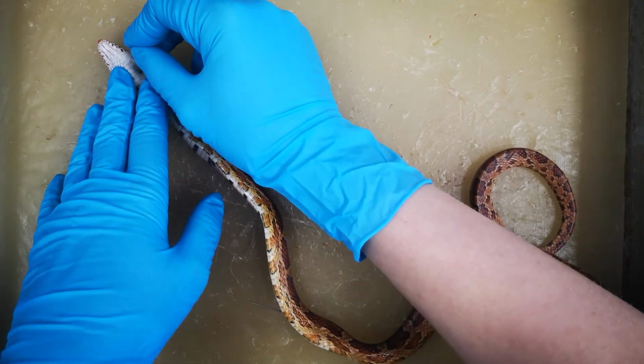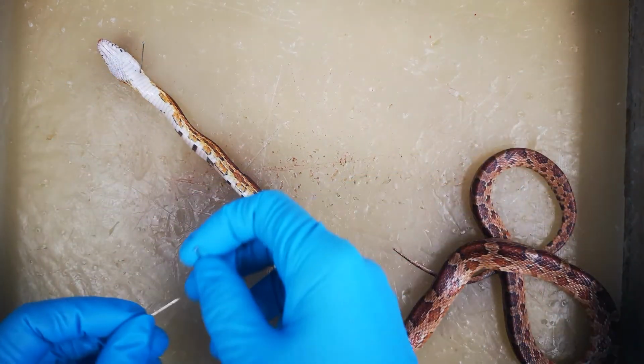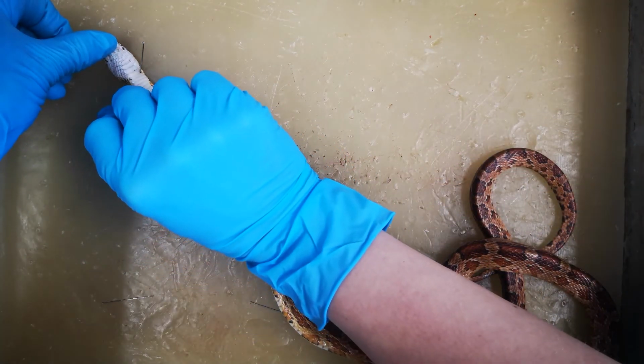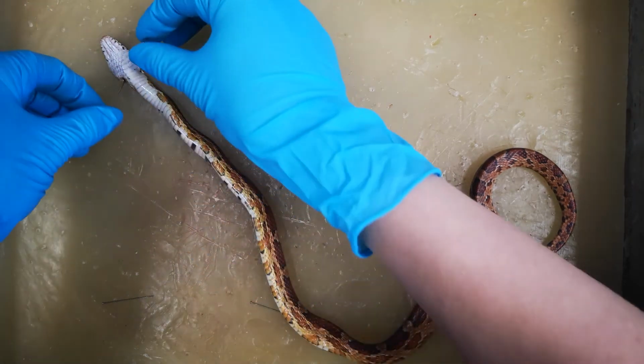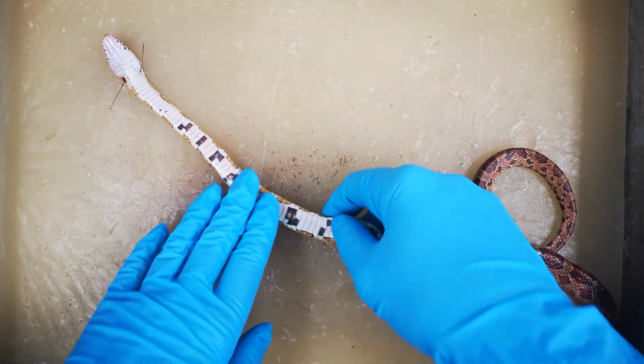To prepare the snake, we pin it in place. As it is long and lacks limbs, pins must be placed through the body. We take care to not puncture any vital organs by placing the pins to the sides.